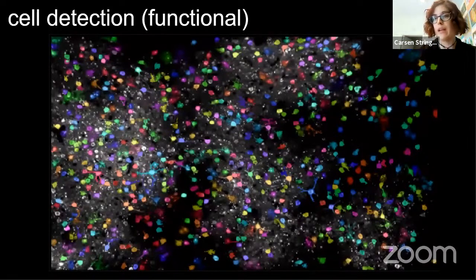It is fully automatic, but afterwards, in the GUI, I don't have this included, but you can open up an image like this and start putting ROIs on the image. You can draw little ROIs and click a button to extract ROIs there. Suite2p can allow you to manually add ROIs if you want to. In our case, with our cortical recordings, we get lots of neurons. We get 60 to 70,000 cells per recording because we're really lucky to have this great microscope. So we don't want any more cells. Even if maybe there's a couple of cells that Suite2p missed, it's fine. But in some cases, users might want to do that, and that's totally possible in the GUI.